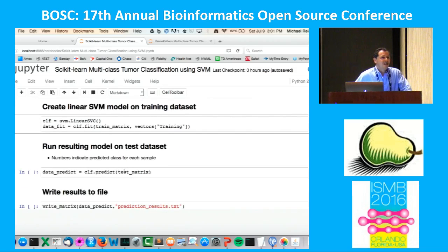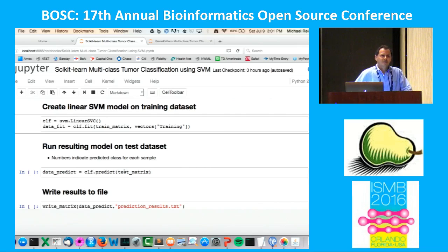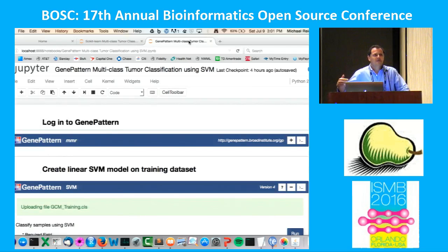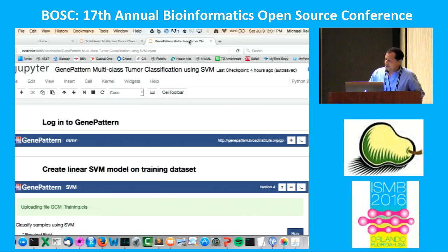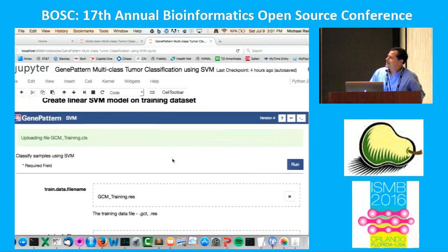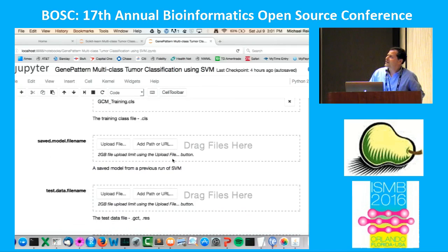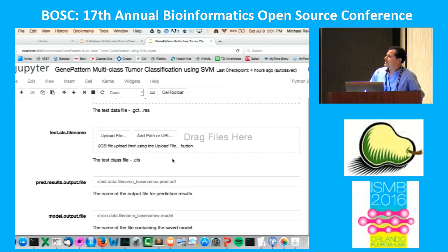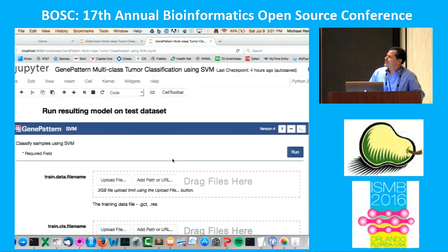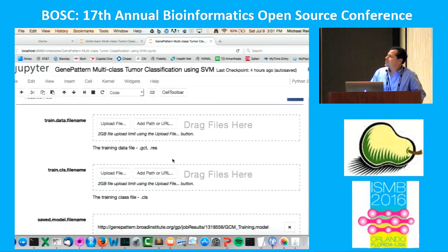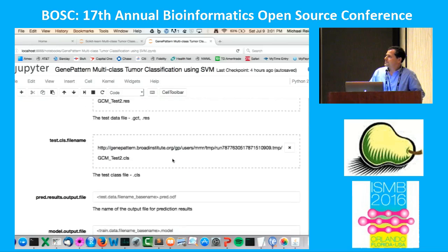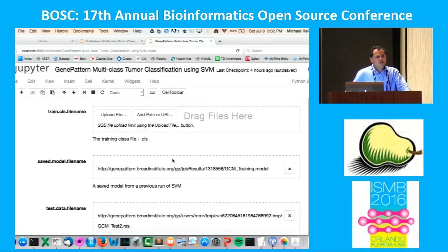Yes, I trained a model with one line of code, and I ran that model on a test set with one line of code — but look at all the things I needed to do to get here. Now, taking a look at the GenePattern notebook that does the same thing: we log into a GenePattern server, we create an SVM model on our training dataset, and there's no code. I'm filling in fields of an HTML form and uploading datasets. Once done, I send the resulting file to another SVM analysis that will run our module on the model I just created. You can see the difference in coding required between Jupyter with Python and Jupyter with the GenePattern notebook extension.